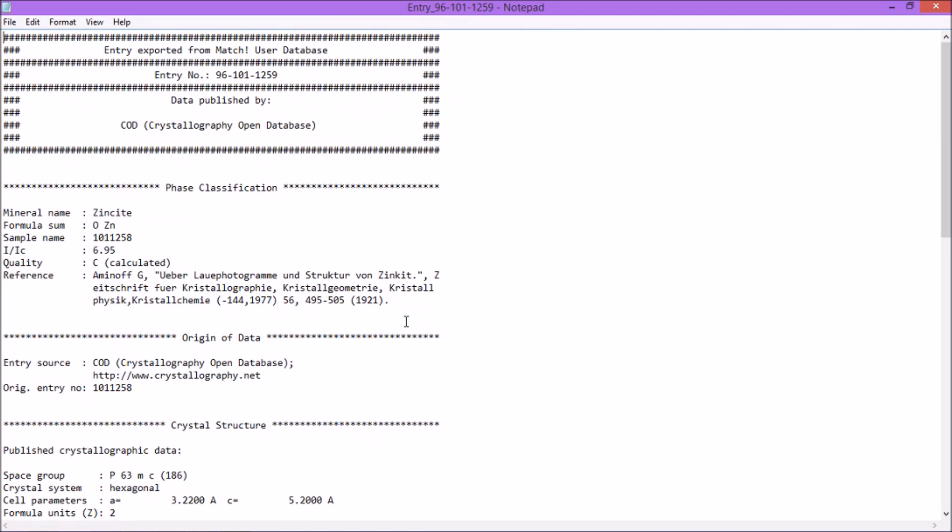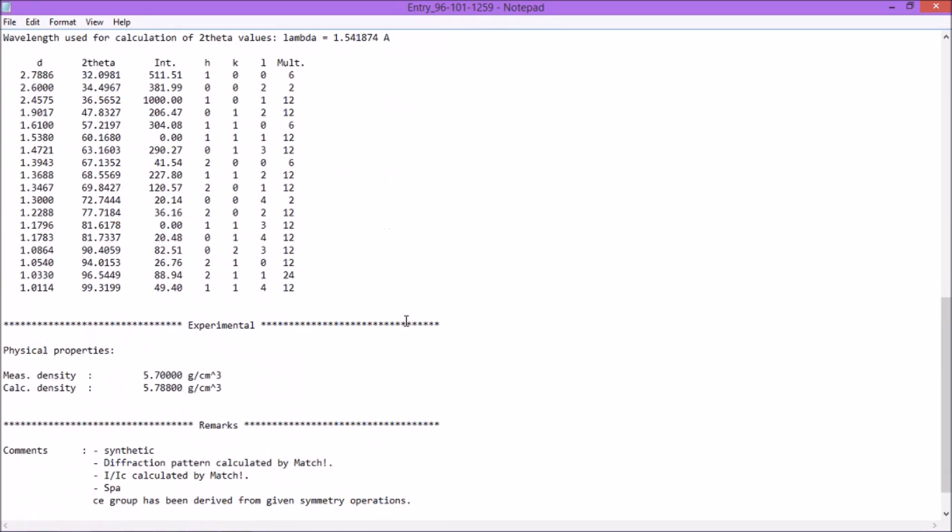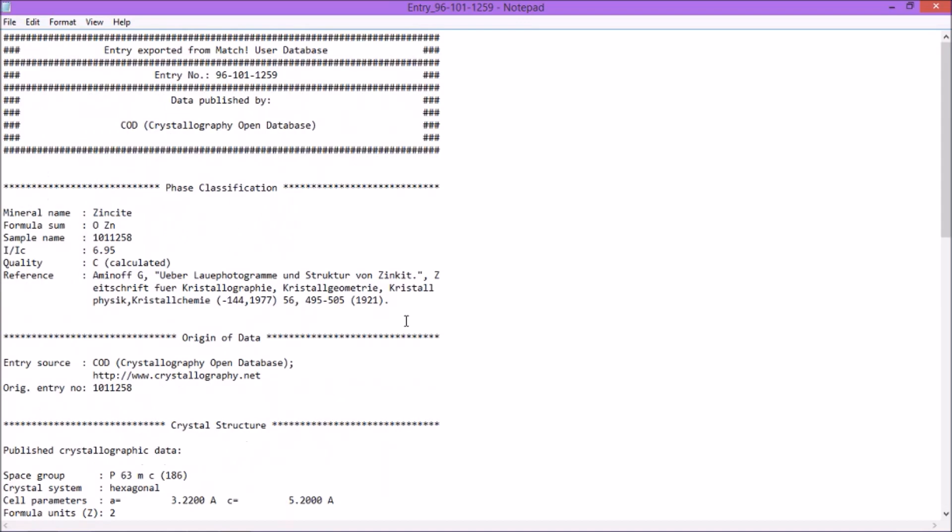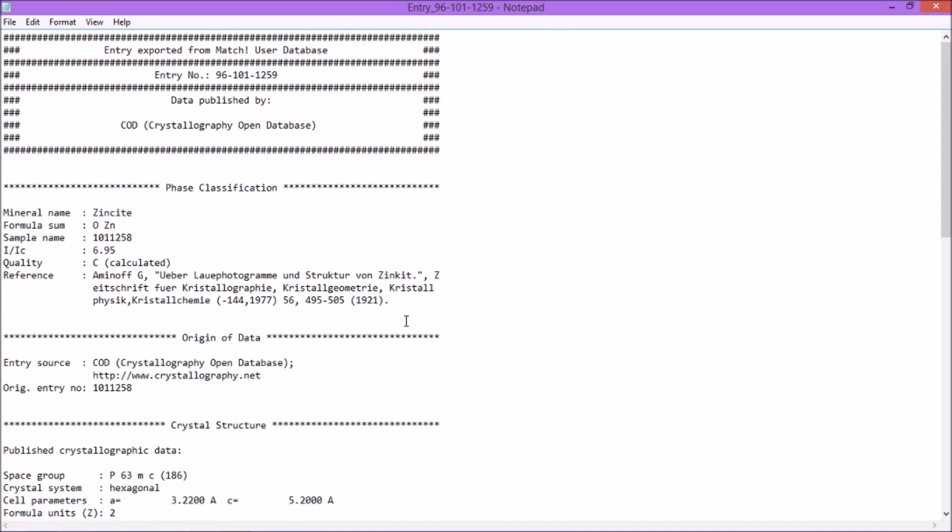I have just got it on my desktop. It's a complete data file, entry file. So I think it's very good to have that. I have obtained it and hope you can also obtain it following this method.